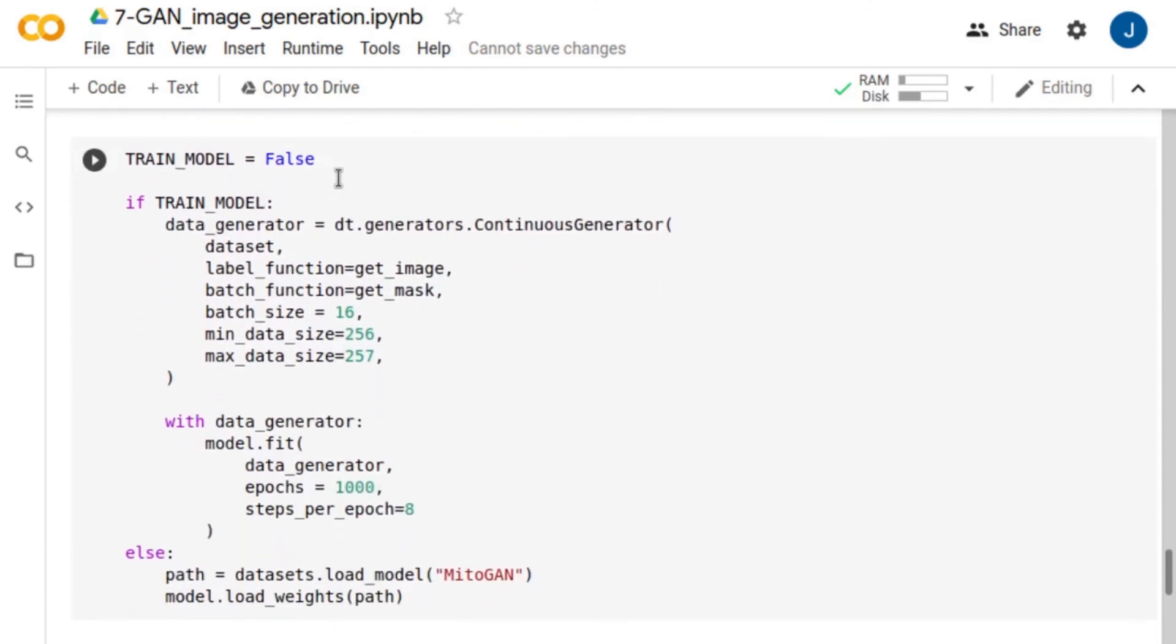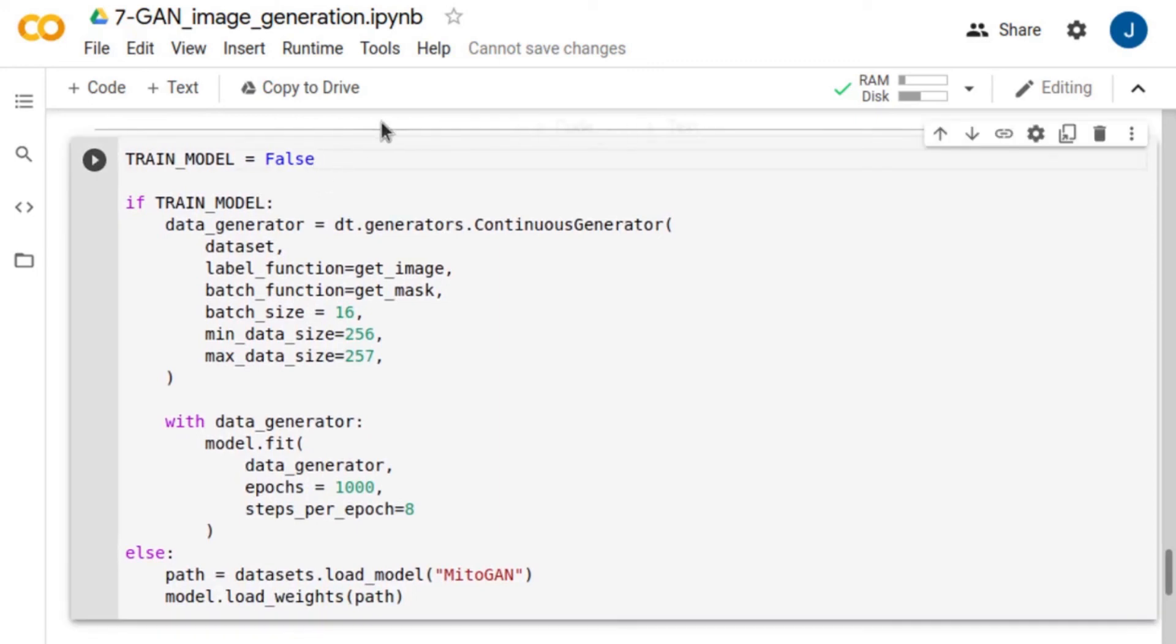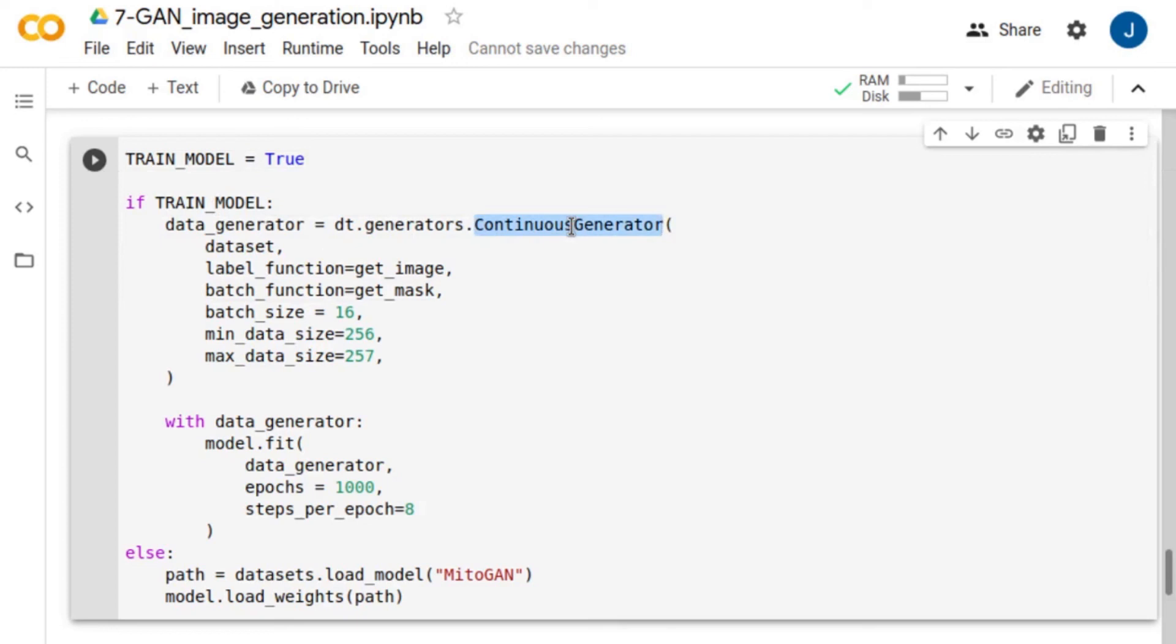Now, it's time for training. Here, we use a continuous generator to continuously generate images during training.